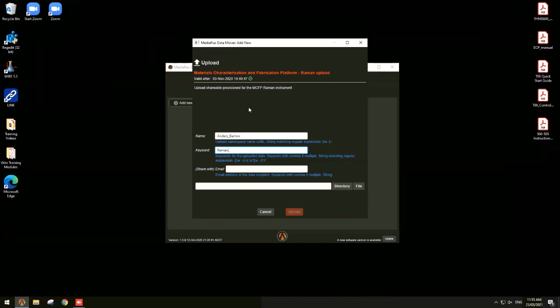The other keywords I'm going to use describe the samples that were analyzed in the data set itself. So this is lead white and titanium. Now you notice you can use white space in here. That is okay for these keywords.